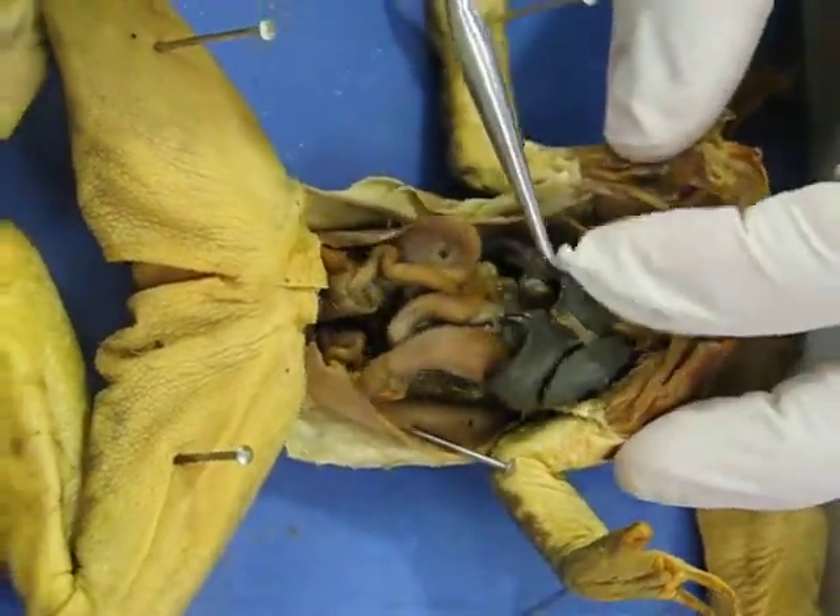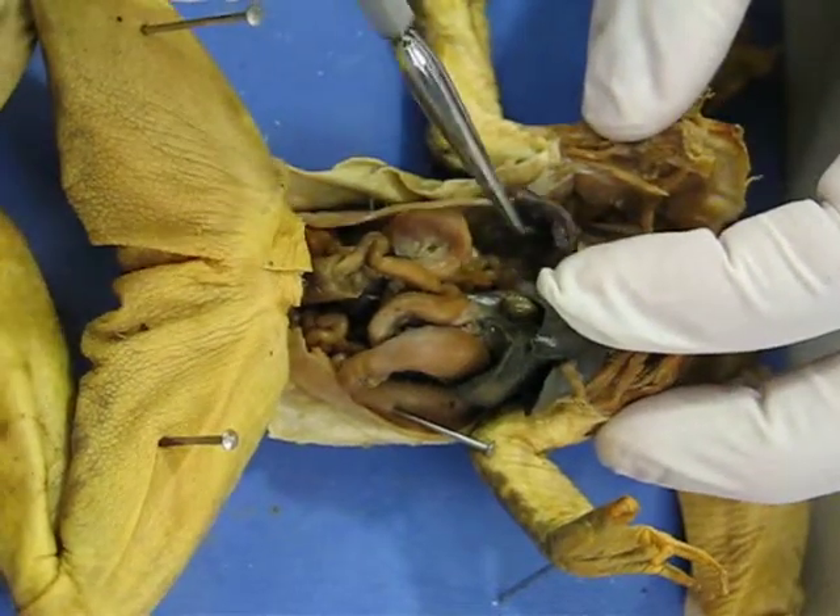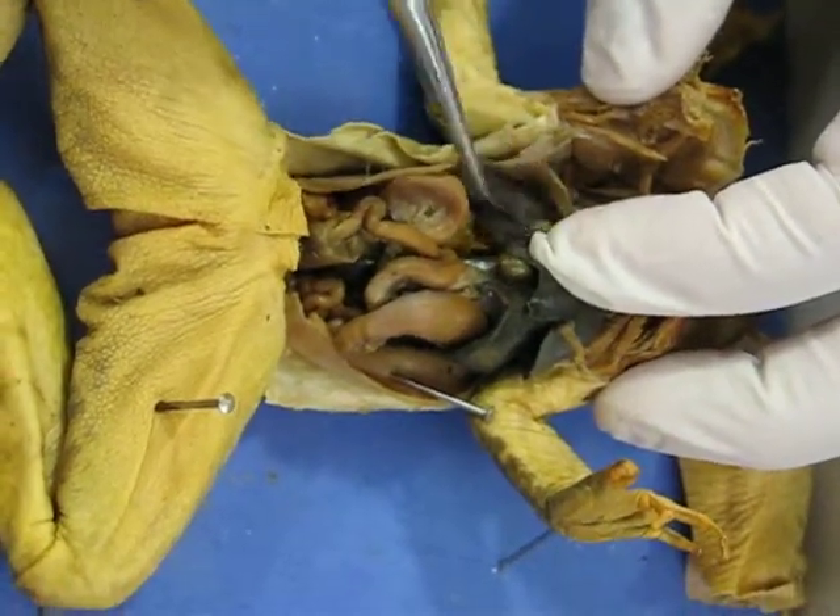Off the side of the heart and on the side of the liver is something — a dark structure. It looks a little mushier, and that is the lungs.